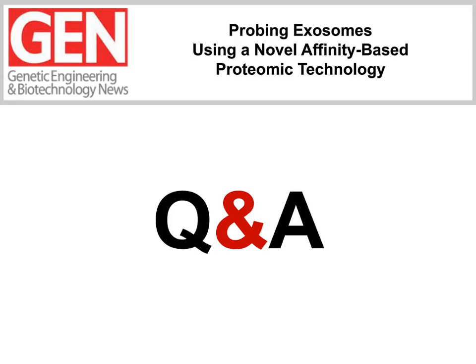Of course, plasma is more complex than serum, so what you gain by doing one thing, you may lose in terms of the complexity of the sample. And the last point is in terms of how you assess the purity of the sample. This is, again, a very tricky question, and people take different views on this.